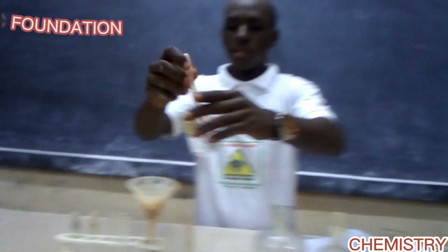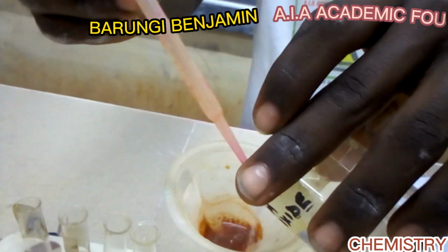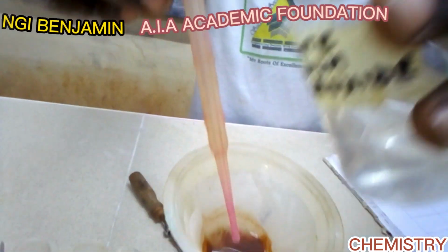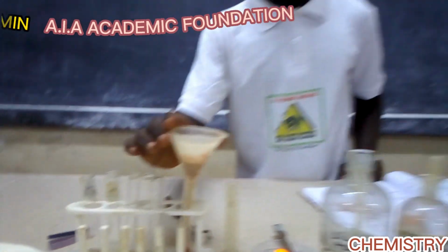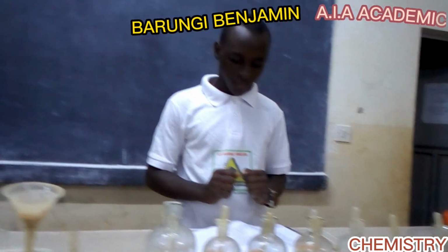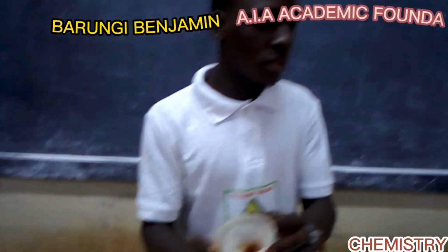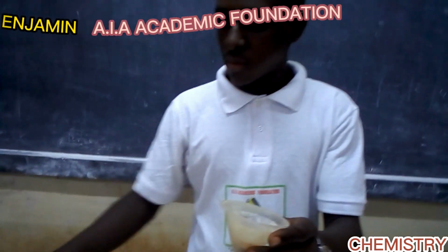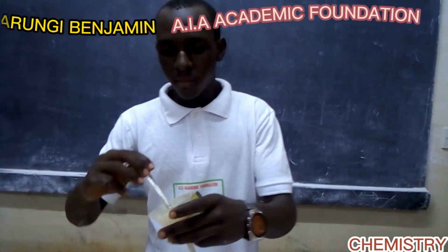So we shall just add it inside here. Now we have washed our residue in sodium hydroxide. Now they have told us to dissolve it in a minimum amount of dilute hydrochloric acid.